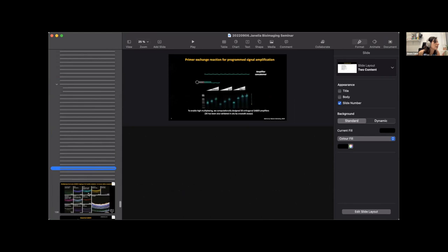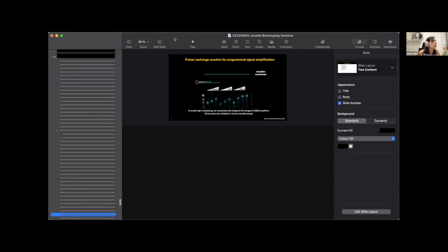morphology after these. So this marker is a nucleolar marker, and even after 200-fold amplification, we can see the signal still confined to the right compartments, whereas other amplification methods like tyramide signal amplification, which are quite diffusing, are starting to go even outside of the nucleus, with the label spilling out. So this is why we think it might be good for high resolution subcellular applications. I mean, not super resolution, but high resolution applications in general.